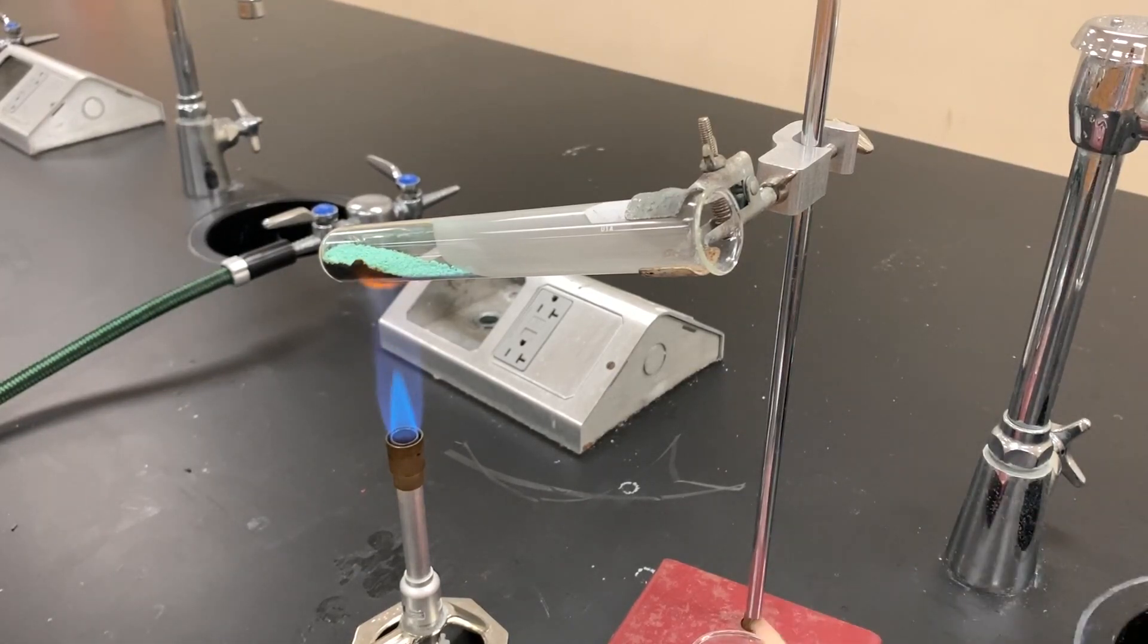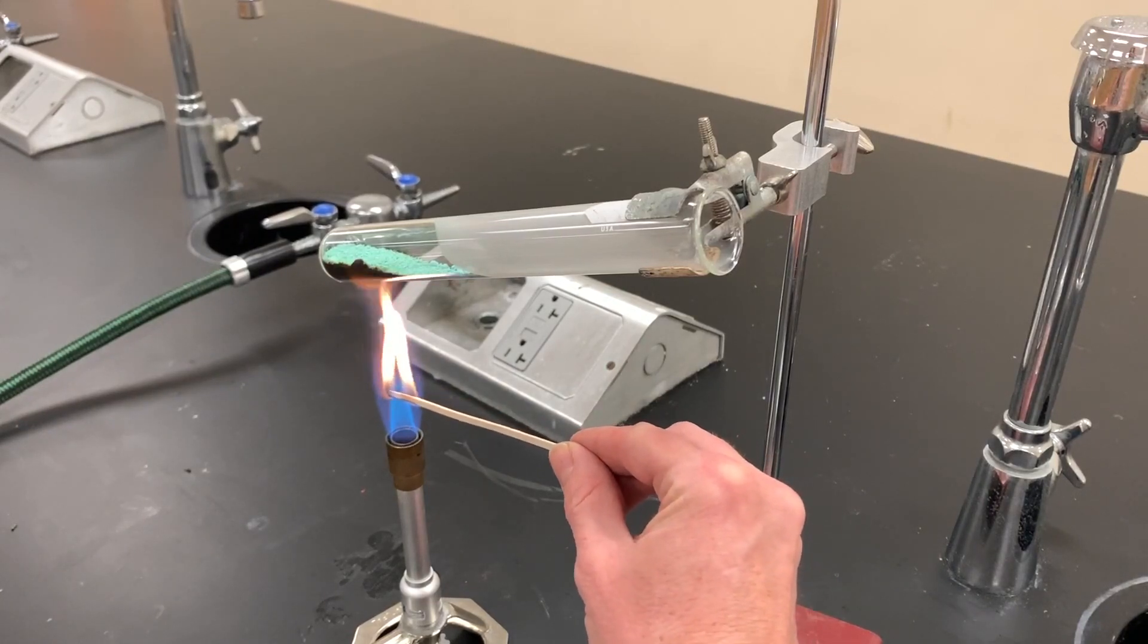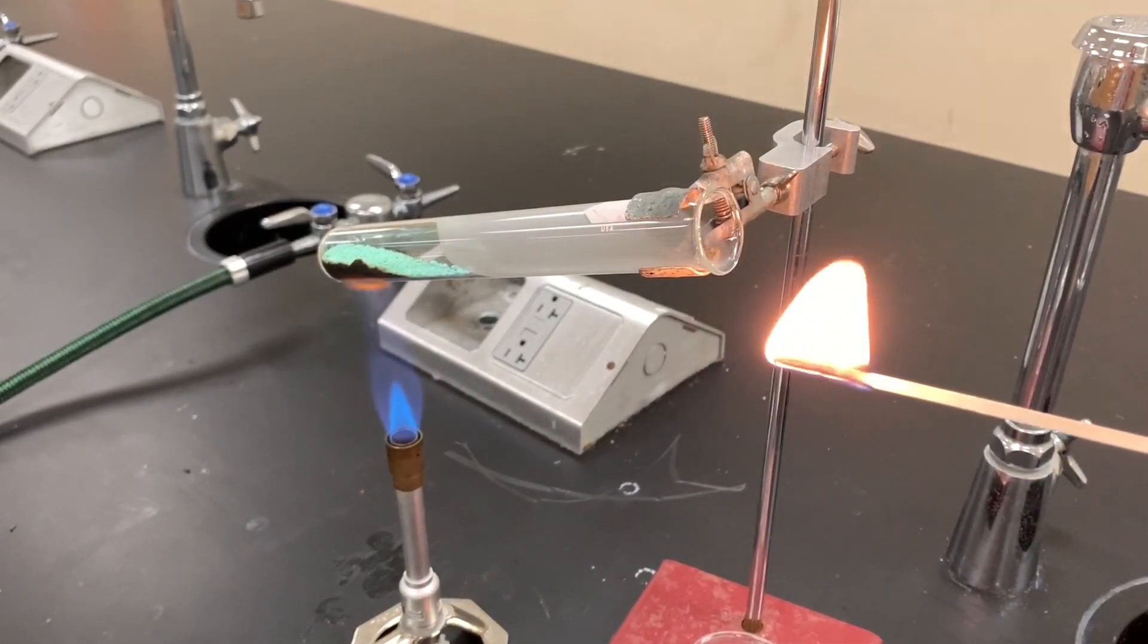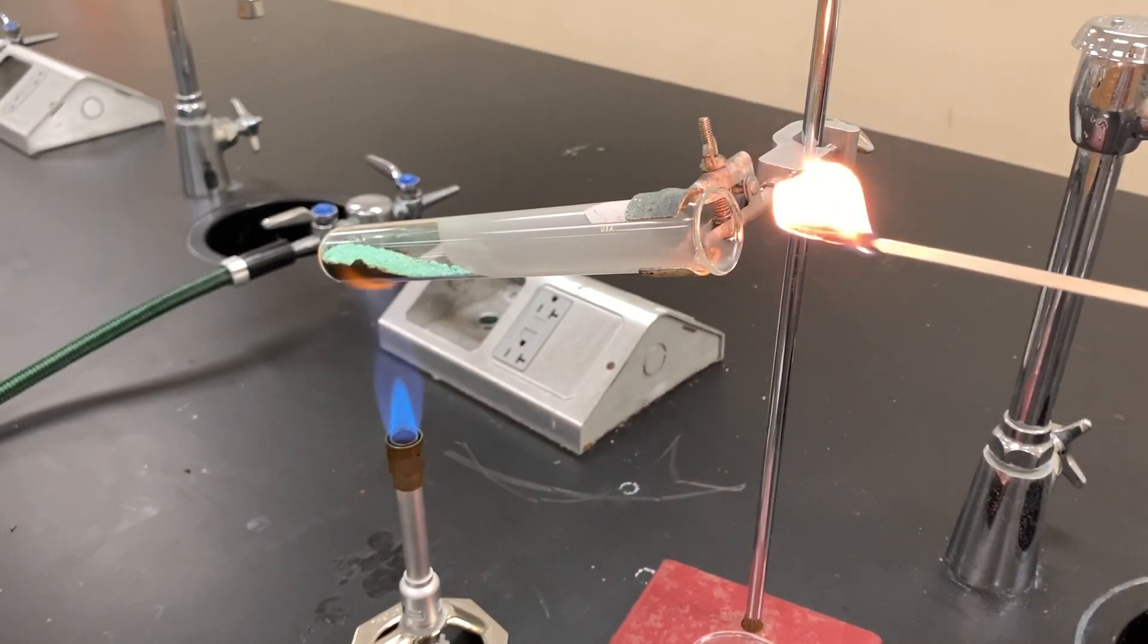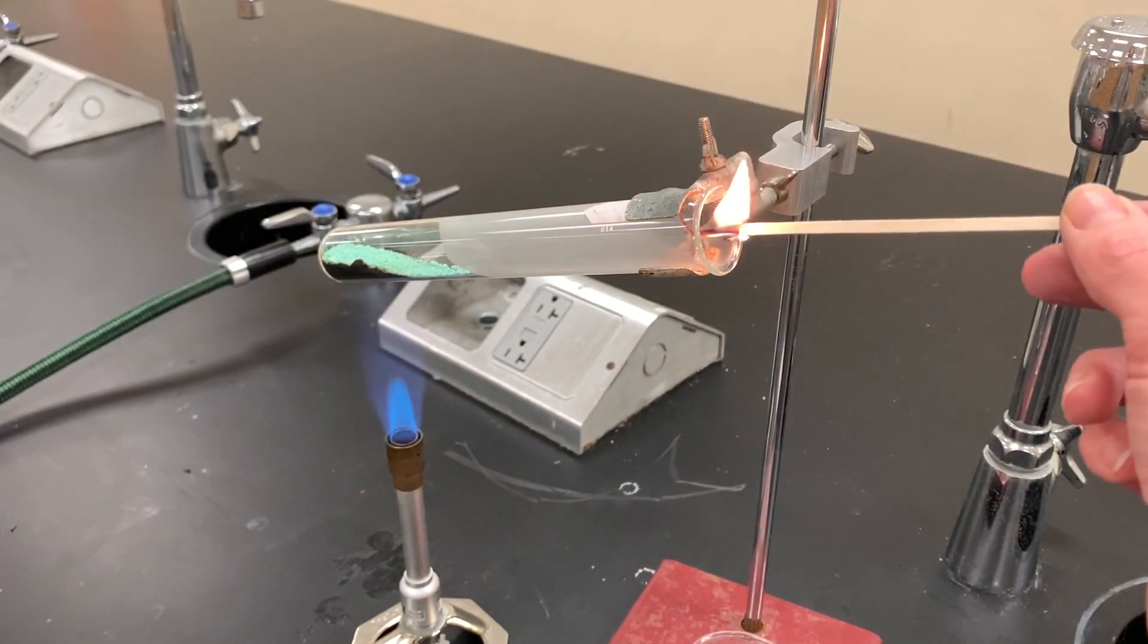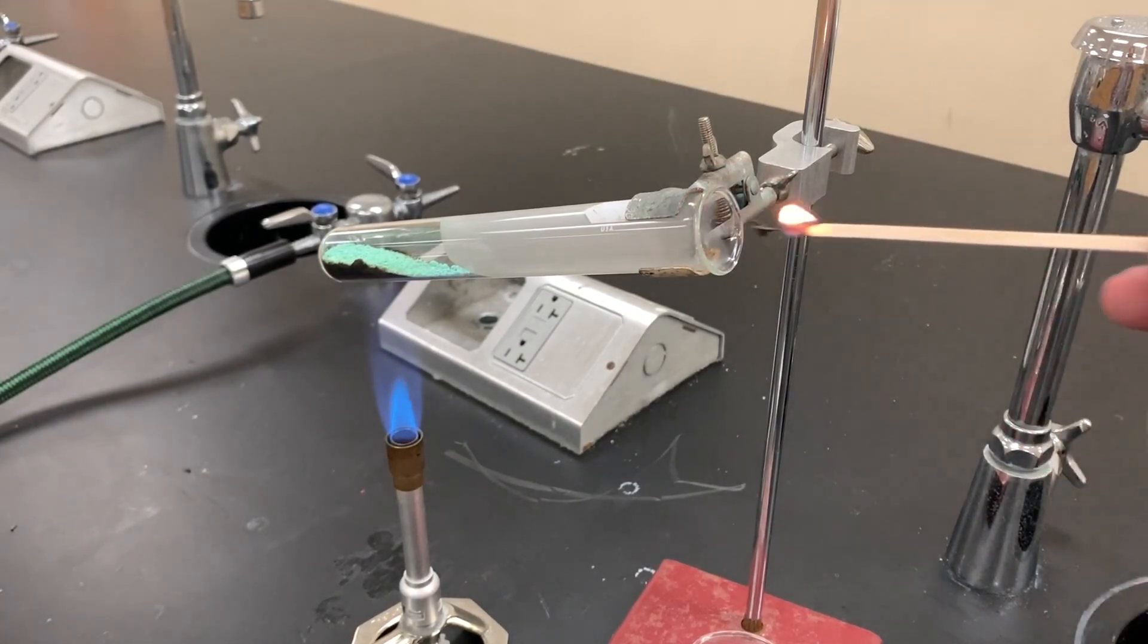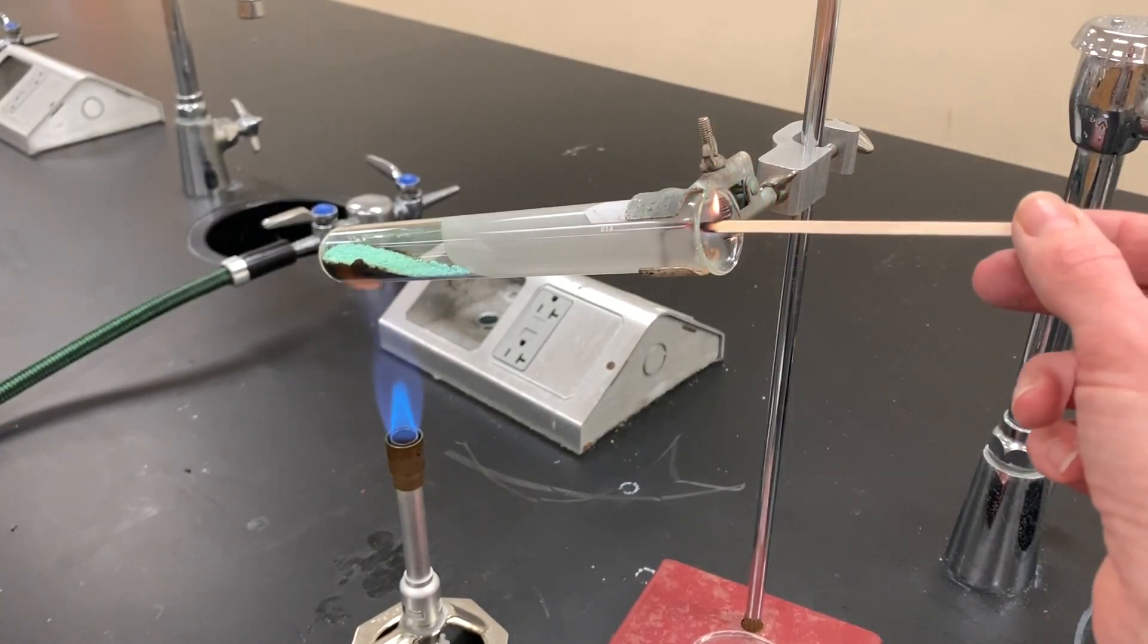One test is to take a wood splint and light it. If the wood splint is extinguished, that means carbon dioxide is probably leaving the test tube as a product, and that definitely looks like that is happening as I put this near the inside of the test tube.